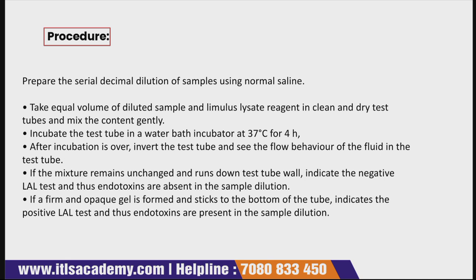But if a firm and opaque gel is formed, and it sticks to the bottom of the test tube when you invert it, what does that indicate? It indicates a positive LAL test, and thus endotoxins are present in the sample dilution.